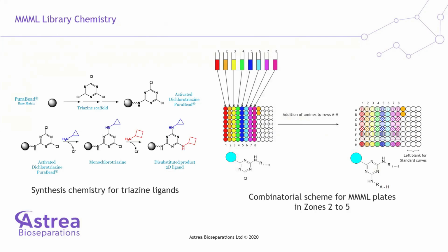And so just to recap what the library is formed of. You've seen that there are different zones. Each one of the zones has a different character chemically, but the base chemistry that we use is a triazine base, and on the left side of the slide, you can see a schematic of the chemistry.